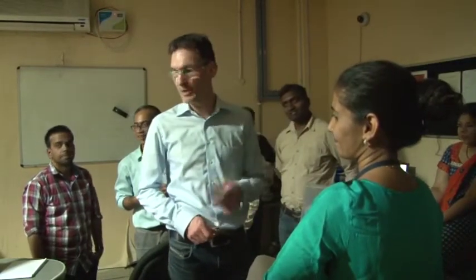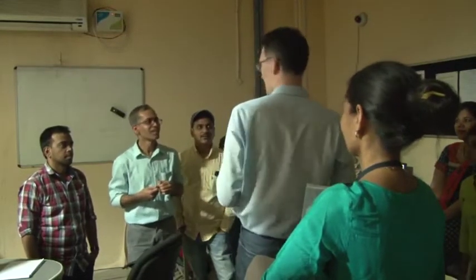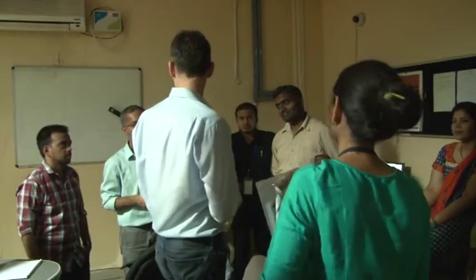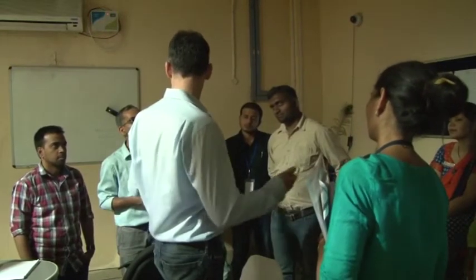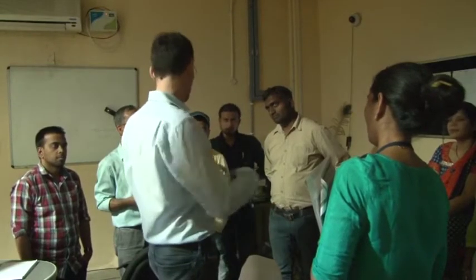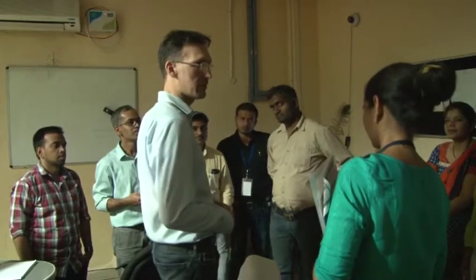So I wanted to do some STEM imaging right now, just to switch to STEM imaging to show you some, let's say, diffraction contrast in STEM imaging and pure chemical contrast. And we're going to do that, I would say, this week, Monday to Wednesday. There should be an opportunity that you join the other groups in the afternoon, at least for the second half.